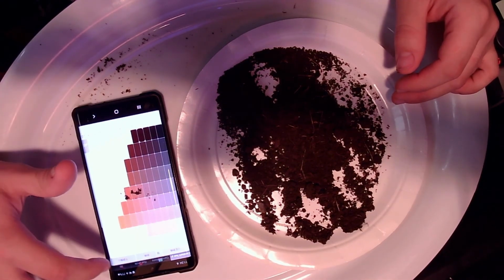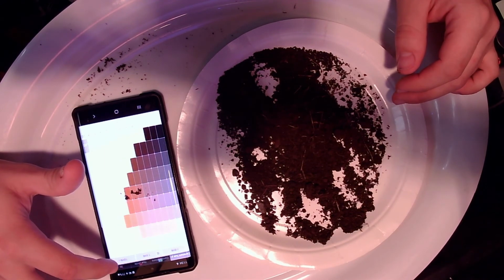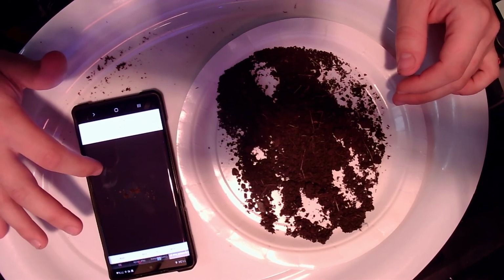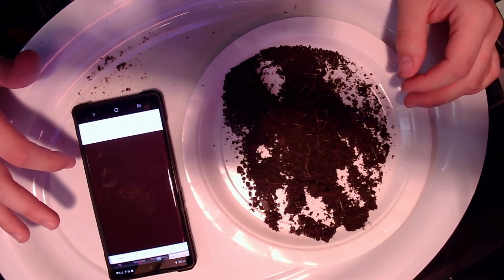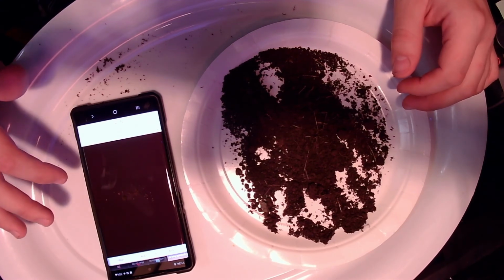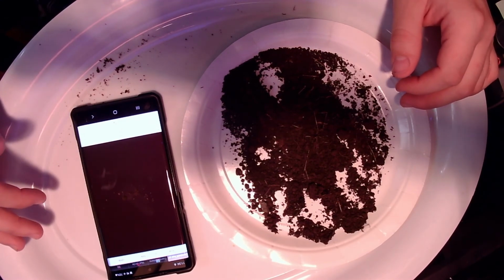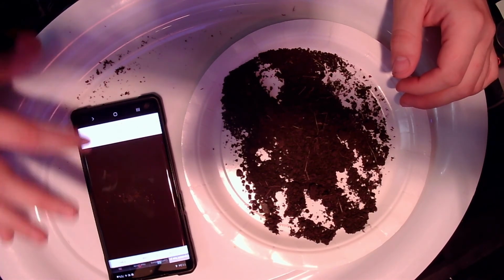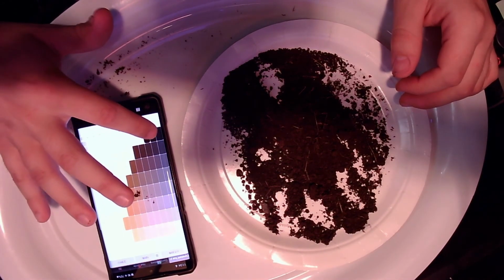I'm just going to look at the 7.5 just to see what's up. So that's what, 7.5 1/1, 7.5 1/2. I think that's the closest so far. Let's try the 10YR. Go back, look at the bottom.